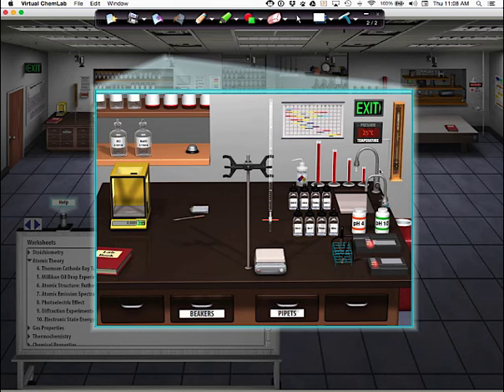Step 8 says this. Bring the bottles into the lab. So guys, what's going to happen when I grab one of these bottles? You're going to get circles. So I'm going to put this one here, and I'm going to put this one here. All right, so now I've done step 8. I brought the bottles into the lab.